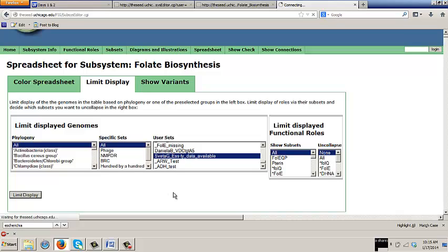Right, it's quicker. And if you want a picture for presentation, like Valerie said, you put time into making your display exactly as you want, and then you can save and export data to Excel. So you can carve all the sequence space of microbes, color it to your liking, sort it, and then export and publish or keep it. We'll show you how to create a subselection of genomes that you can ask for at any time. That's what she did. She selected some genomes, and now you can ask to see the spreadsheet only in those genomes, if it's genomes you use all the time or a subset that you want.